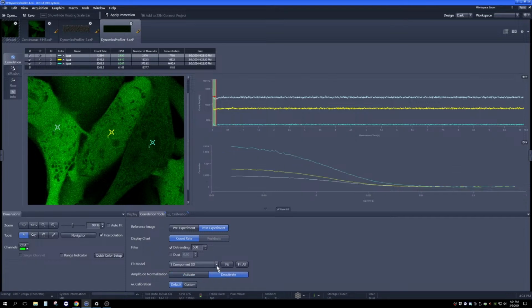And we did try to really make this friendly in terms of the math. I know math can be the most intimidating part of FCS, in addition to the fact that it is very hard to measure biological samples because you will saturate the detector quickly. But we've put the most popular, most often used models in here for your curve fits. These first 4, the 1 component and 2 component, assume free diffusion, so Brownian motion.